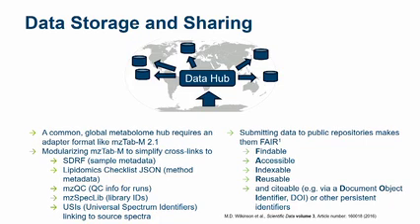Final words on the data storage and sharing. So basically, to interconnect everything with this data hub and also to interconnect tools, we need adapters. And MZTab for metabolomics, for example, is one such adapter. It's a format that contains at least a minimal set of information that you need to report, but also different communities can define different levels of minimum metadata for this file format. So it's pretty flexible and extendable.